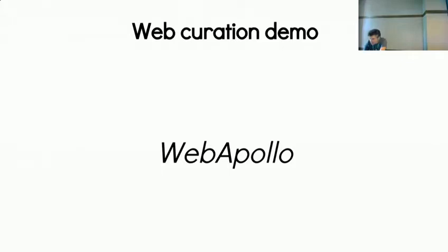The other neat thing about it is that once I have it, I can go in and see here's a history of all the different changes that I've made to it. So I can see not only how many changes, you can actually see the structural changes to those. If I go back to that, now we've reverted back to that newer position. Additionally, let's zoom back out again.